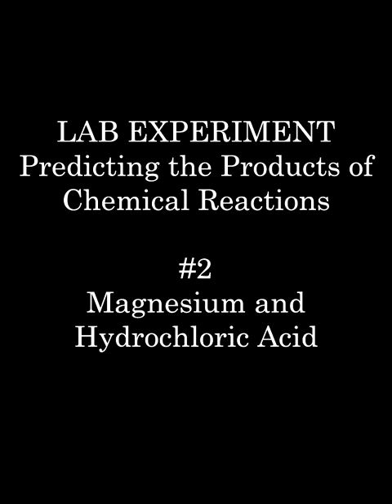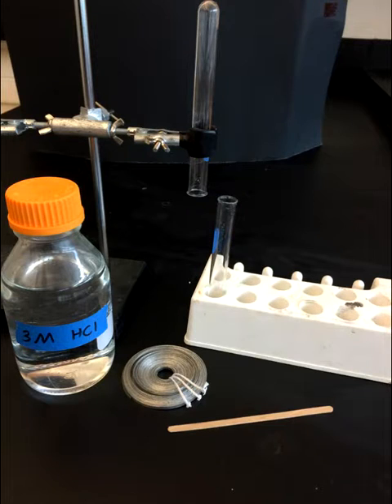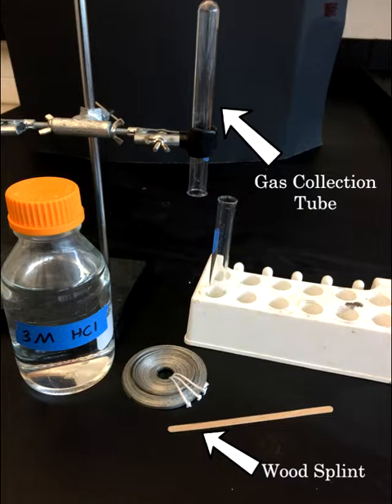In the second experiment, magnesium will be reacted with hydrochloric acid. Here's the equipment that will be used in this experiment. A wood splint will be used to test the products of this reaction. We will also use a gas collection tube in order to collect the gases to be tested at the end of the experiment. We'll be using an inverted test tube to accomplish this.